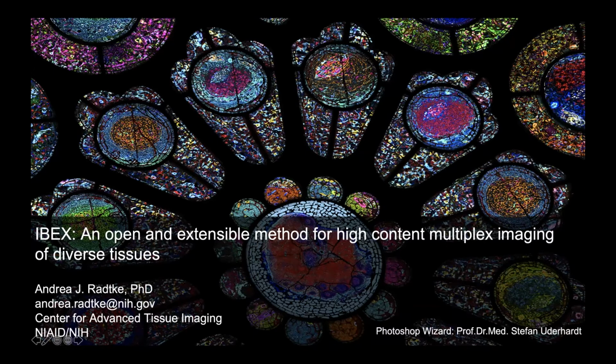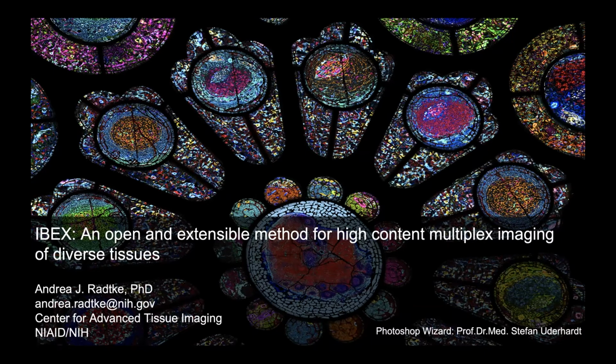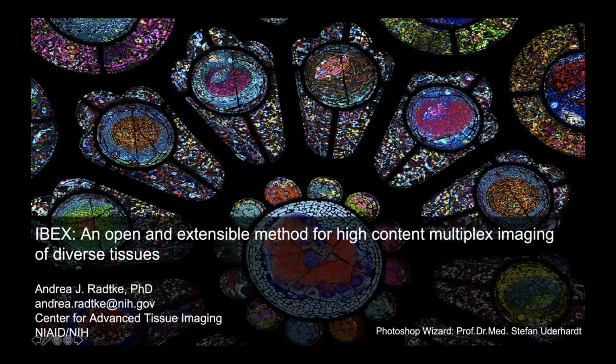I wanted to demonstrate first. This is an image that I captured using the IBEX method that I'll describe today and that we developed in the Germain laboratory. I wanted to put it in the context of a stained glass window, and I relied on the Photoshop wizardry of my dear friend, Stefan Uderhardt. I just wanted to share that with you guys. And indeed, I'm at the NIH.